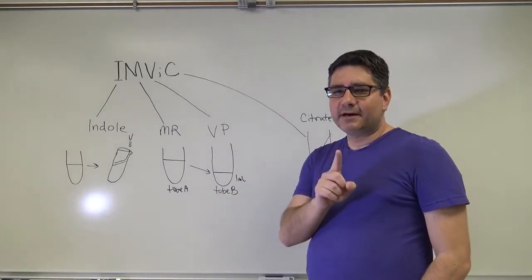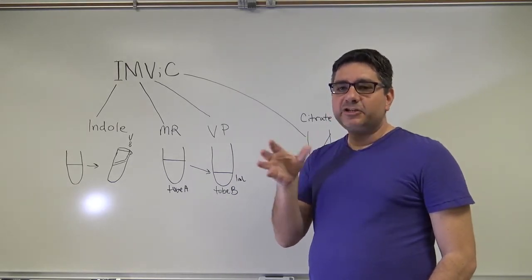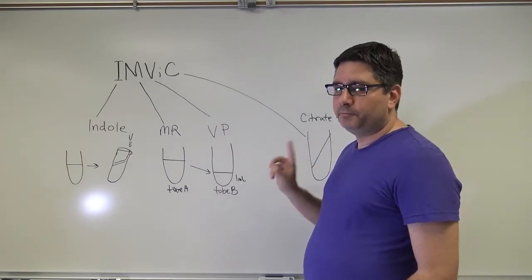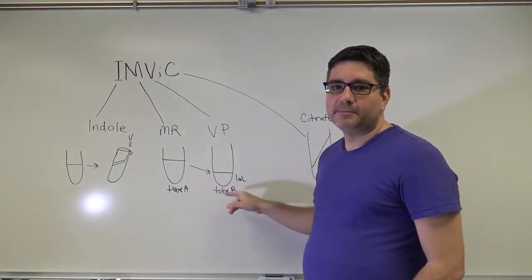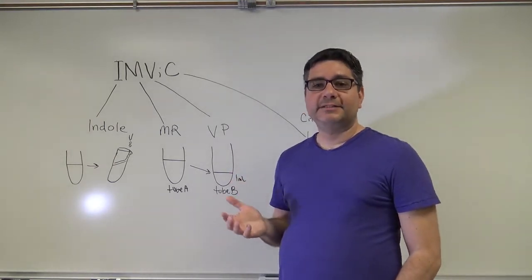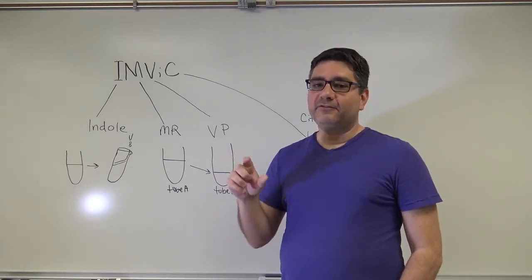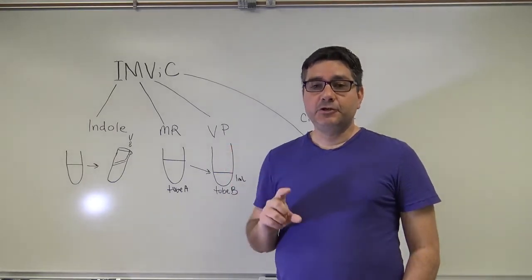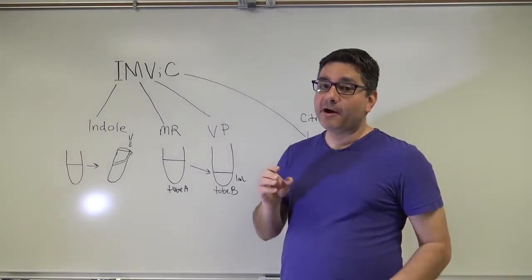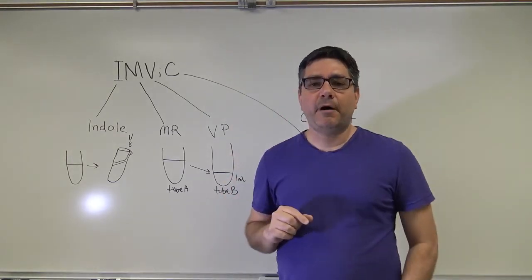It is important to conduct the right test on the right volume, as the reagent amounts have been adjusted for these specific volumes. To the 1 ml tube, tube B, you'll add the necessary drops of alpha-naphthol and 40% potassium hydroxide, as spelled out in your lab manual, and can be found in dropper bottles on your lab bench. This tube should be left for up to 15 minutes and should periodically be aerated by simply tapping the tube lightly against the side of your palm.